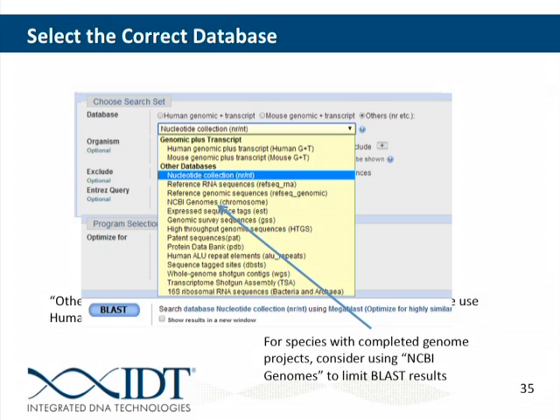So the PrimerQuest assay will spit out a forward primer and a reverse primer already. In the assay, it's already reverse complemented. So that is what you use, and that's then what you put in BLAST there? Yes. Okay. Because I think BLAST is searching on both strands and it's kind of keeping it in conjunction with the forward primer. So yeah, it just saves a step of having to reverse complement all the time.